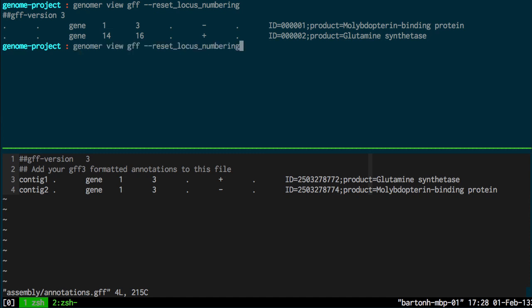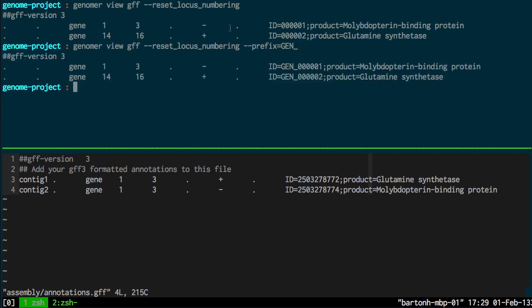I can also, for example, when you're submitting a genome, often need to add a prefix like this. Again, the IDs are updated accordingly with the prefix.